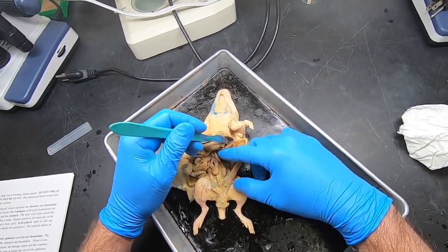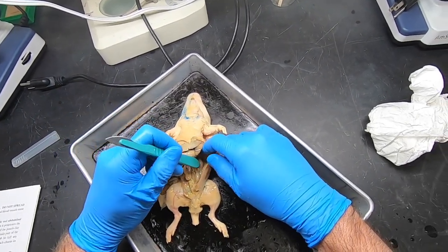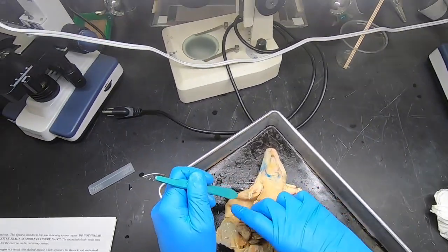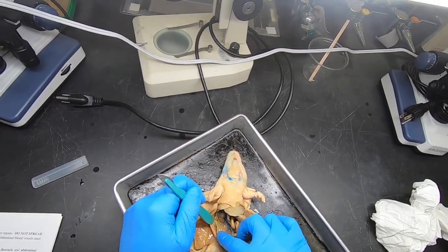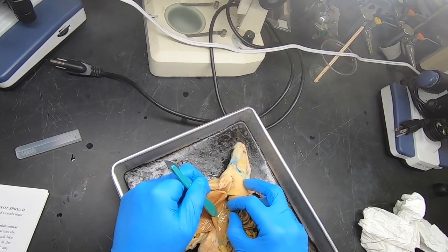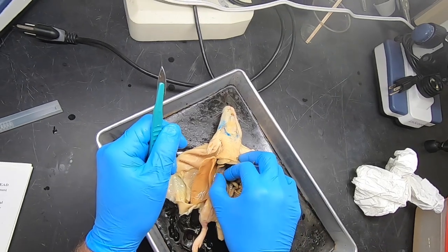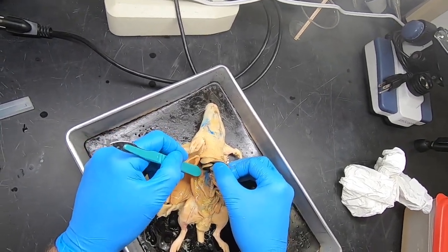And underneath there, we can find at the back towards the dorsum the kidneys—the left kidney and the other one, the right kidney, which is trapped there under some mesentery.